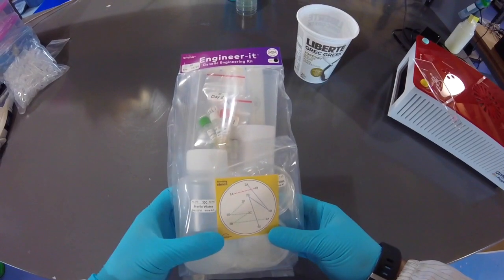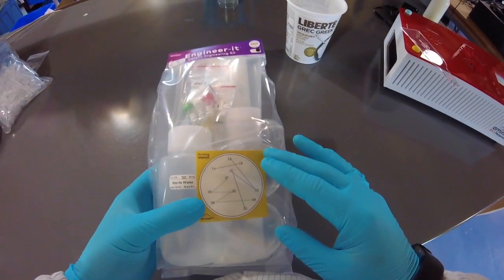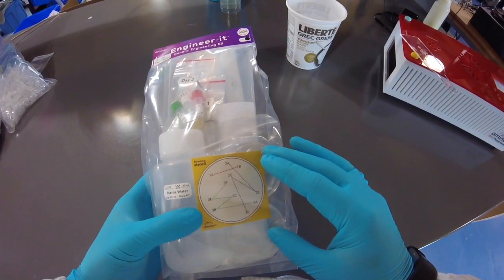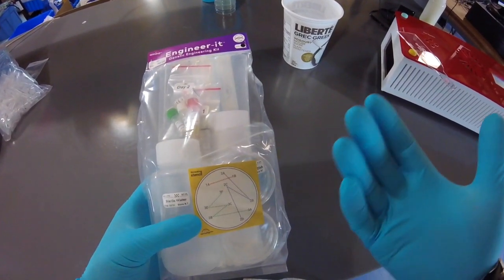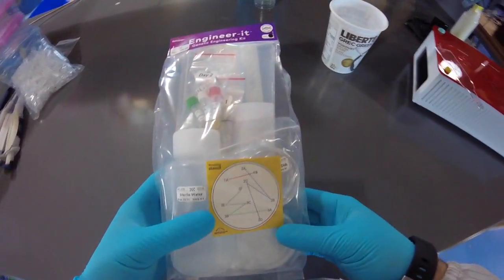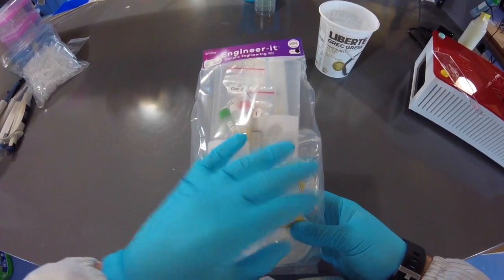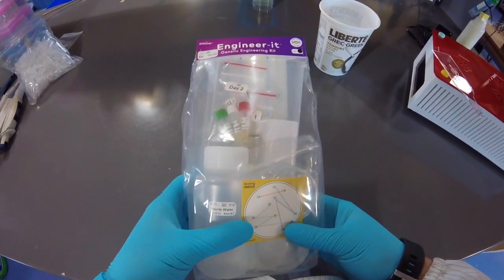Alright, so generally how it works is day one we're going to be making Petri dishes with LB agar. That's the stuff that the bacteria grow on and eat, so that they can grow and divide. And then we're going to streak some bacteria onto those plates so that they grow and divide for tomorrow.